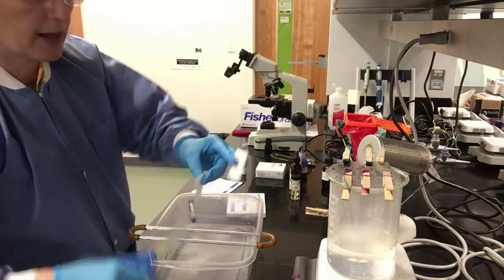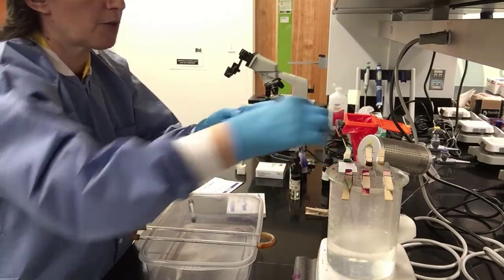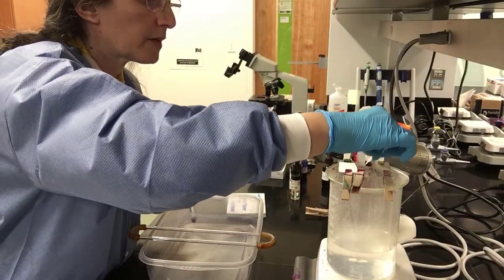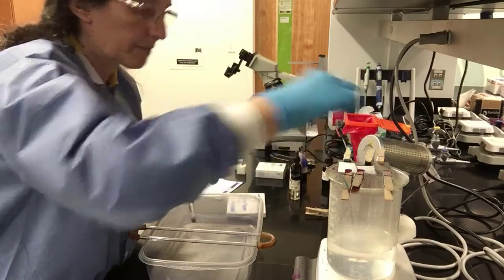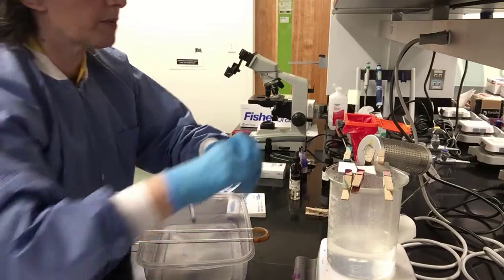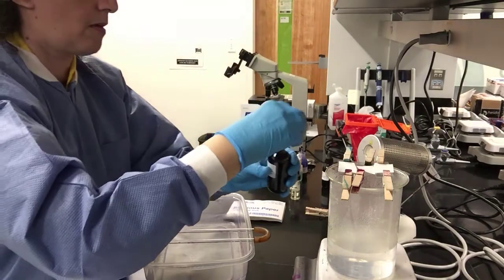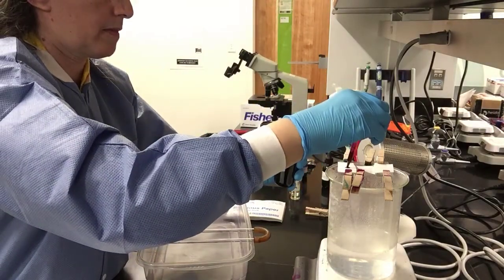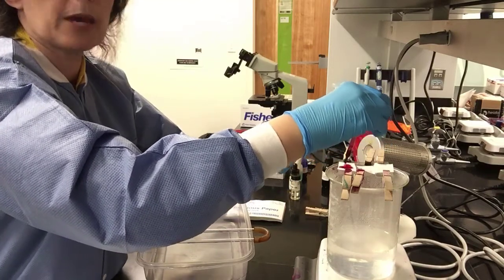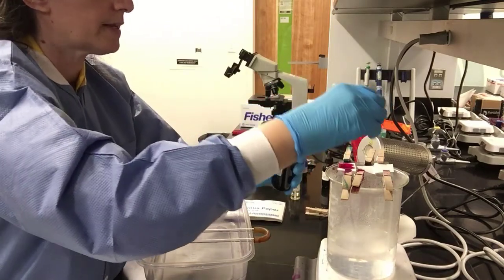Now, I'm going to do this as fast as I can. I'm going to place it right there, right above it. We have another one, a little too long. Cut it a little bit. Place it right there. Okay. And then we have our third little bibulous piece and put it right there. These specimens with the carbolfuchsin literally drench the paper so it will pass right through and nicely be absorbed by all the bacteria that are present on the slide.